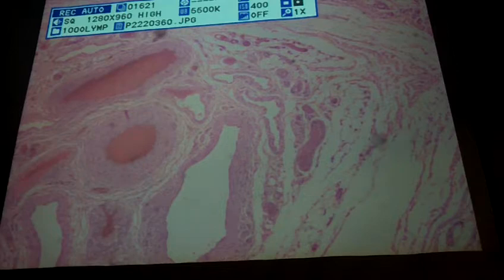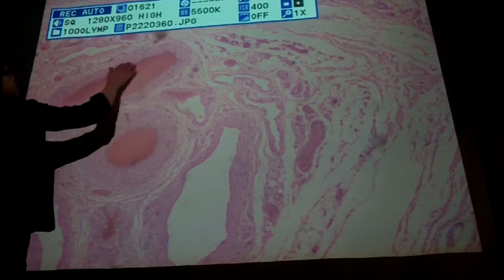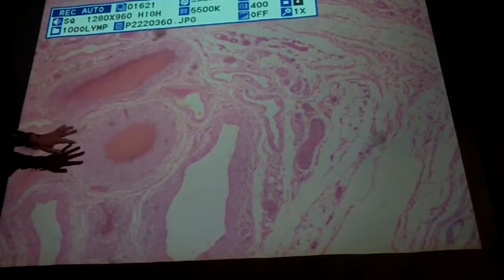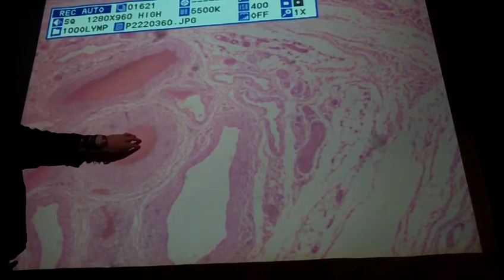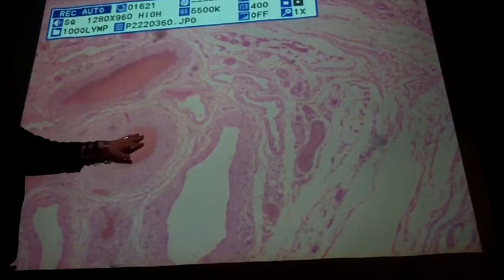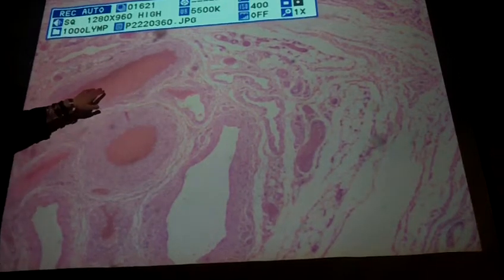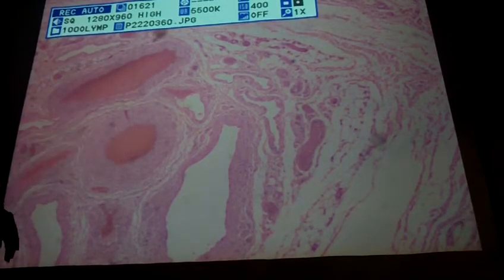ask you. What you're looking at right here, this is also an artery, and this is also a vein. Why these look a little weird is there's dried up blood in the middle of them, and that's giving this kind of pink appearance in here. So those are just blood cells that got stuck in the vessel.